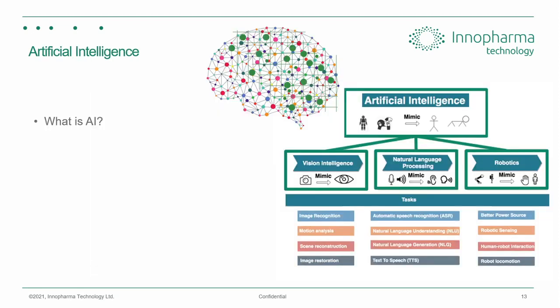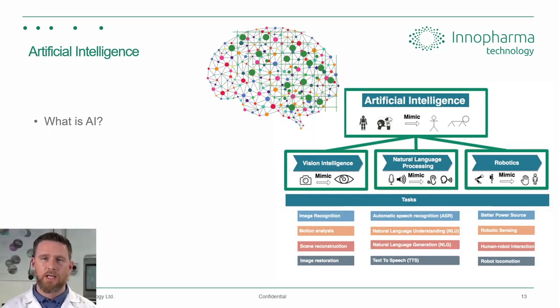But a little bit more then about AI and machine learning and how we're using it. AI is a very broad and encompassing term. I don't believe we have the time to cover all the nuances of what it means today, but I think it's fair to say that it draws different cognitions for different people.